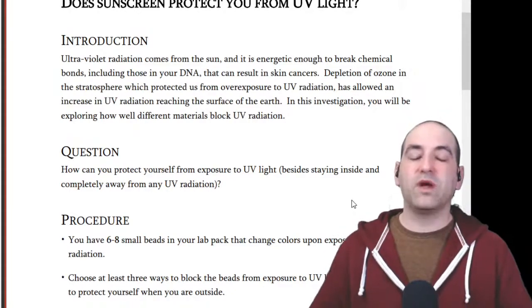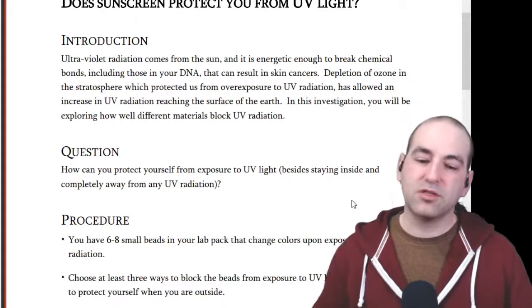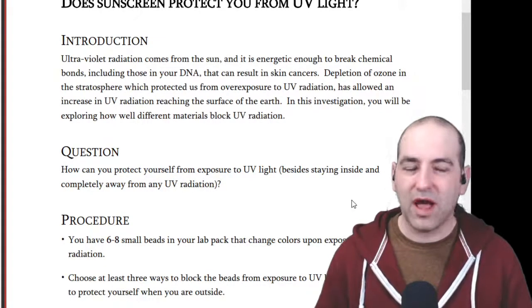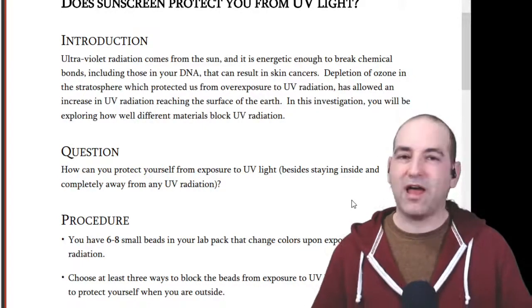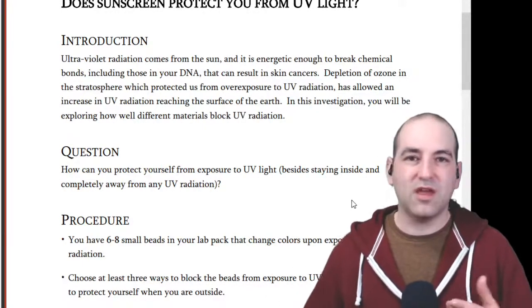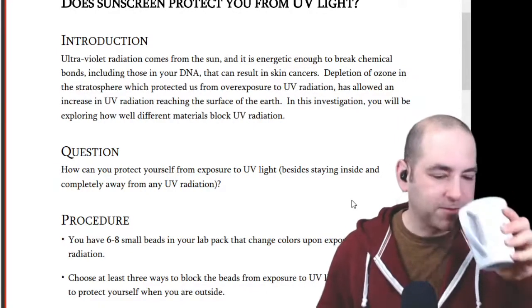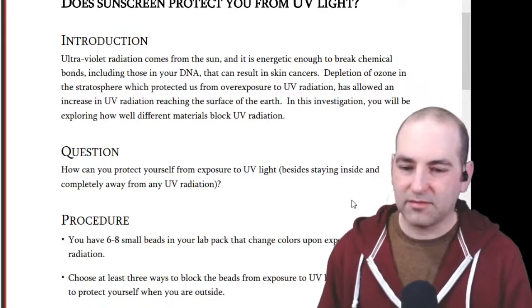There's also different wavelengths of UV light, so you have to think about blocking UVA versus UVB. I don't know what the beads do. I don't know if they're more active to one or the other. We don't really have a good way of testing that unless for some reason you have a source of UVA or UVB radiation. But we're going to have to ignore that part for this experiment.